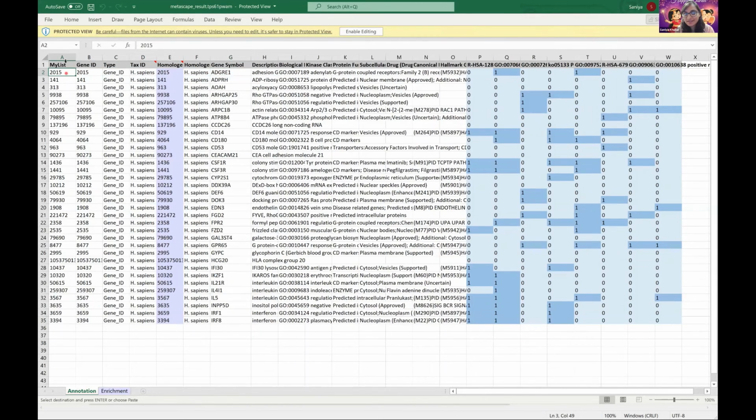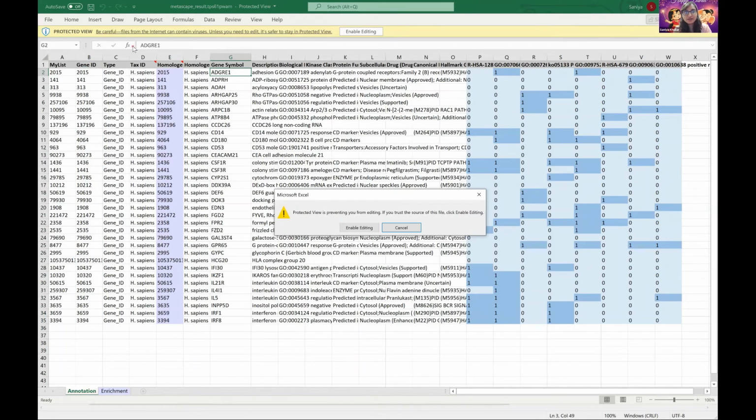So we gave in, this tells you what you put in. So if you put in gene names, it would have the gene names. And you can put a mix of them in too. Mix of IDs, mix of names, but I don't know why you might do that, but it's all good. And then it also maps the gene symbol for you with the Entrez gene ID. So like, this gene, it has this ID.